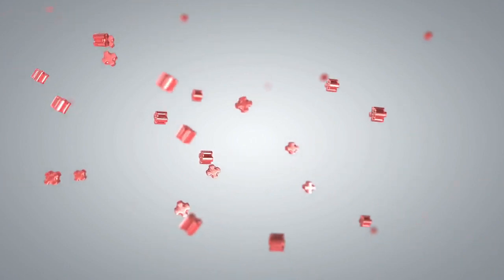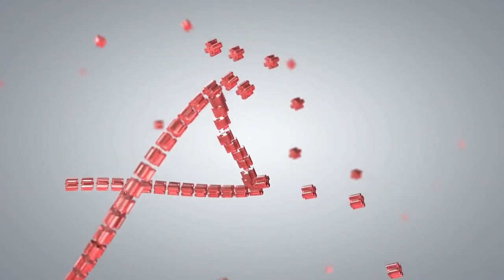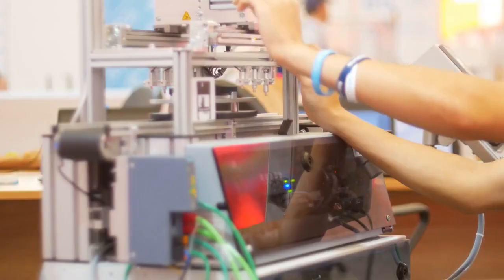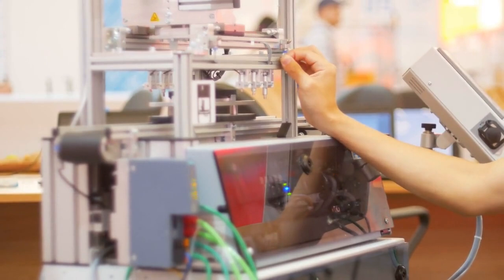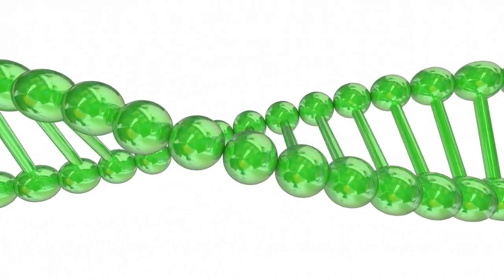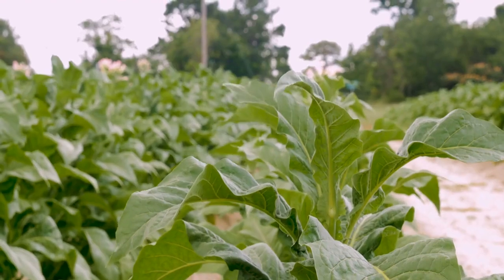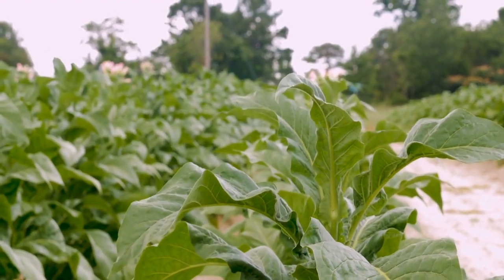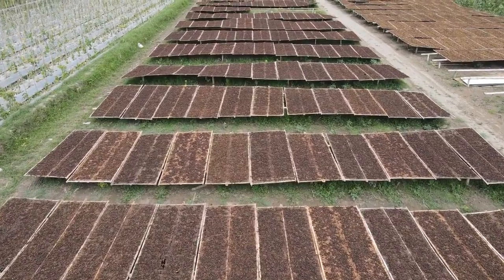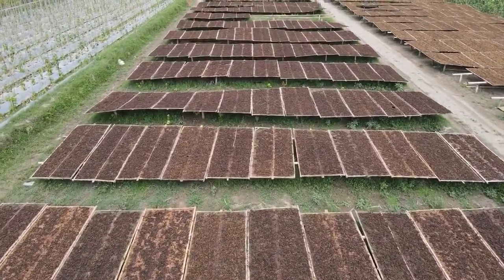Next, using an in vitro transcription system, let TMV-CAD DNA transcribe the corresponding mRNA. Look, smear the mixture containing transcription products on tobacco leaves. Then it's time to wait patiently. On about the 14th day, we can harvest tobacco infected by recombinant TMV. The harvested tobacco is dried and stored at room temperature.